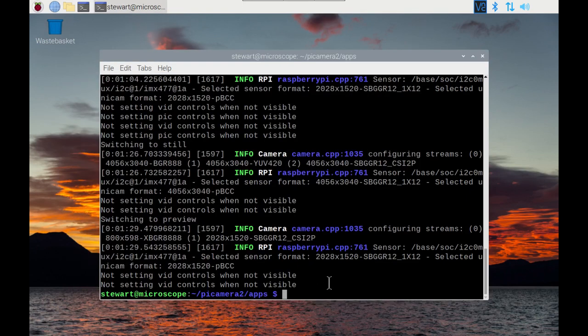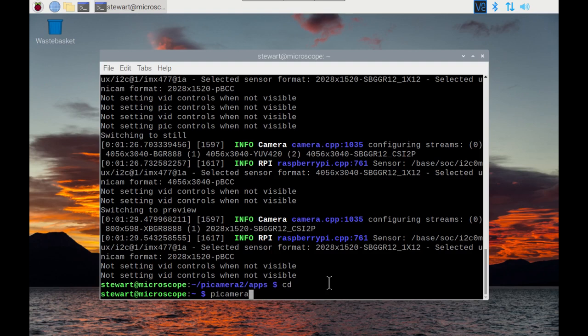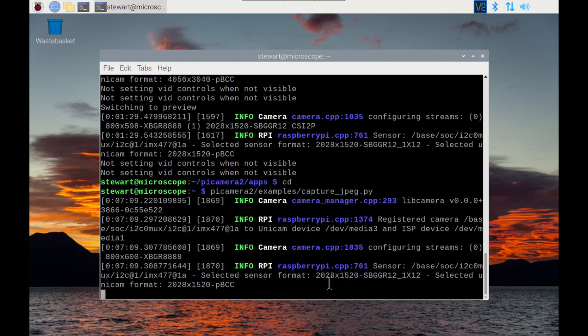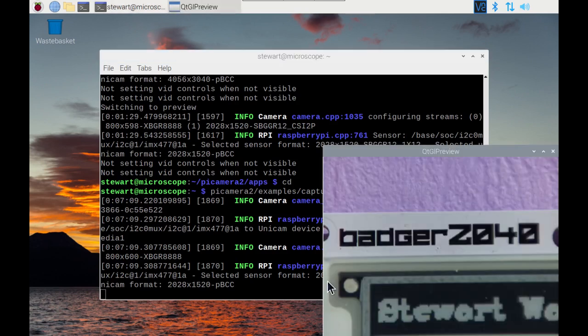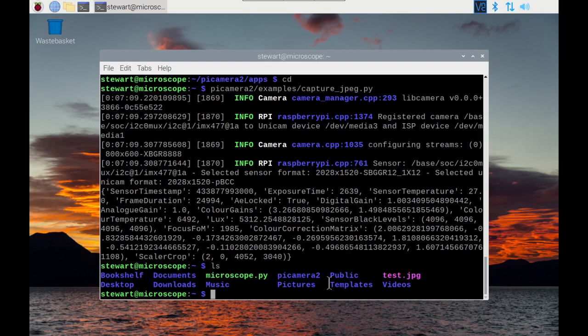So you could also just use the command line. There is an example on here which I can show you, so Pi Camera 2, and then capture, and then capture_jpeg will capture as a jpeg file. It's going to produce a preview first and then it will just capture the file. And as you can see there's a file now called test.jpg.